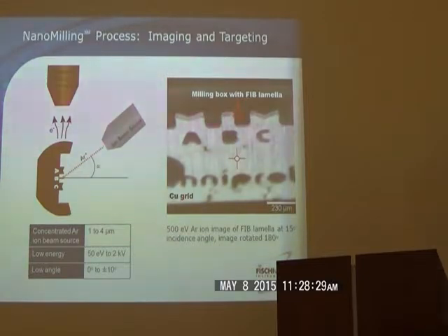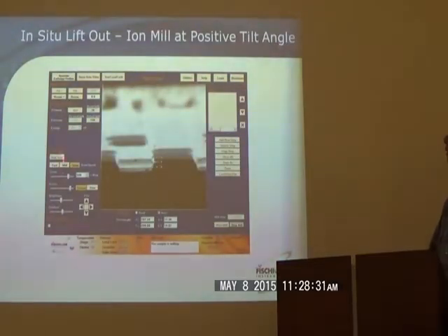Next slide, please. Here's the old software. I'm sorry, Ben, I don't have the new software stuff, but this is the old software, which works perfectly well as the new software. But here's actually what you interface with if you're standing in front of the machine or the instrument. You only need basically one software page to operate.